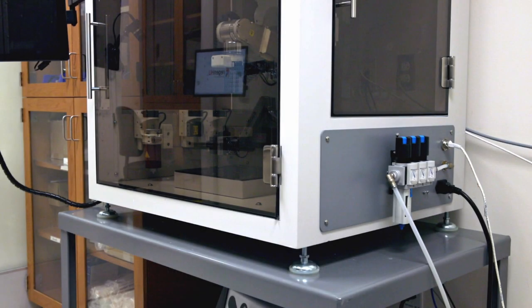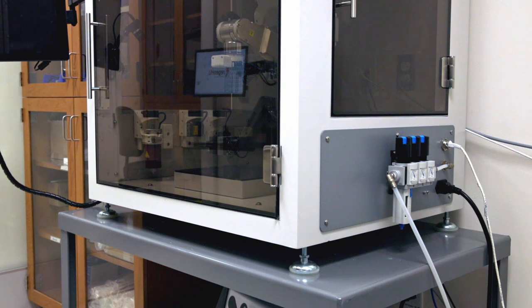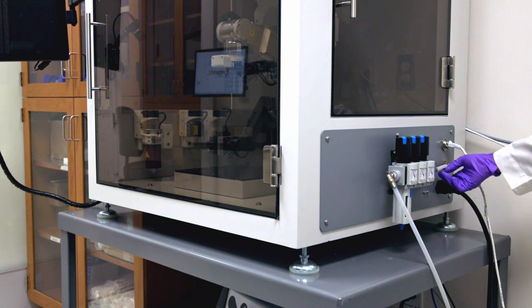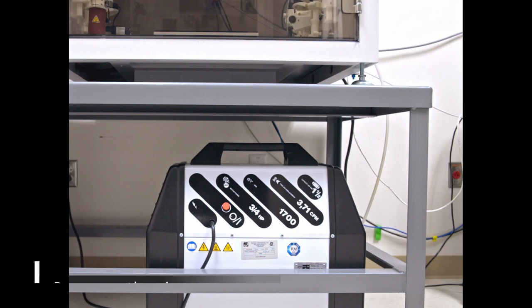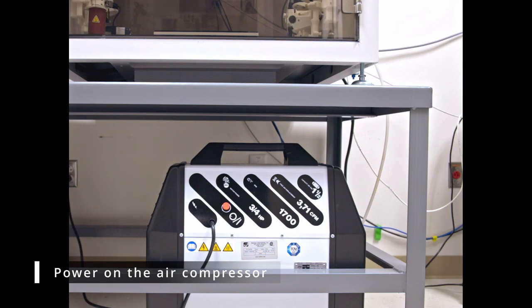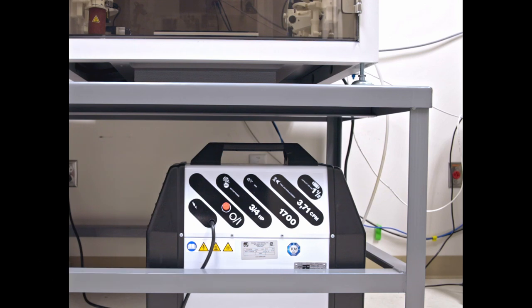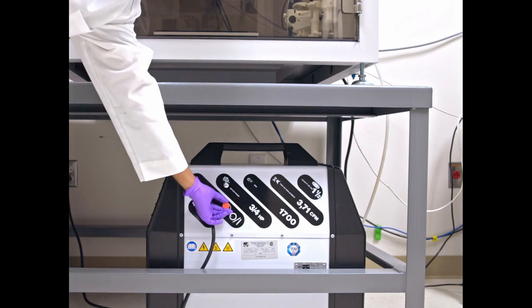Power on the printer by toggling the power switch on the side of the printer. Power on the air compressor below the bioassembly bot by pulling the red knob outwards.